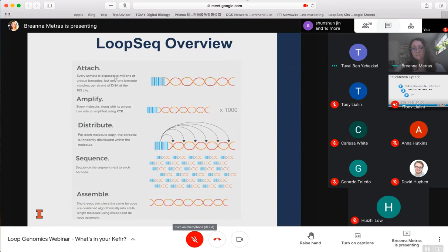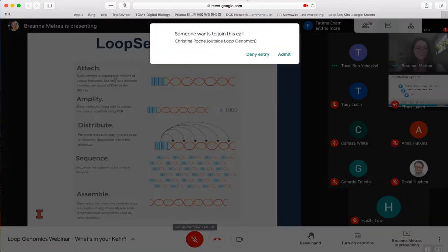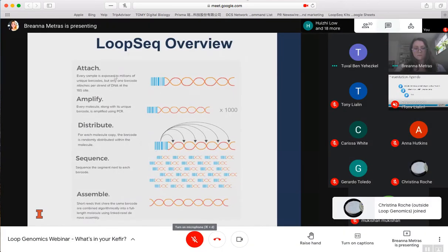And then in the final step, we take these long molecules that have the barcodes in them, and we fragment them down to short molecules that are short enough to be sequenced with any Illumina sequencer, using, say, paired-end 150 sequencing. Those are the shorter reads that you see next to the sequence that have the barcodes on them. Imagine that what you're seeing here is a cluster of short reads that share the same barcode. That means that they originate from the same original DNA molecule.